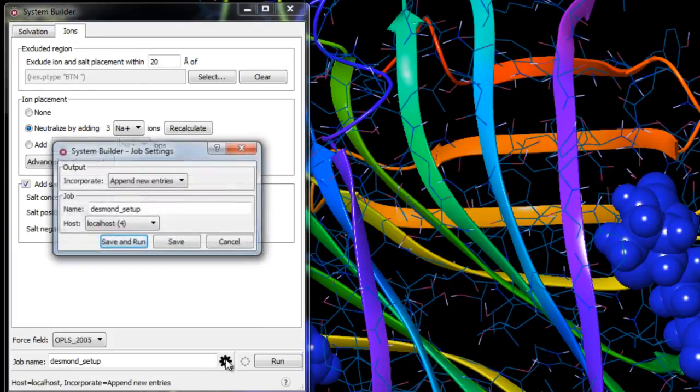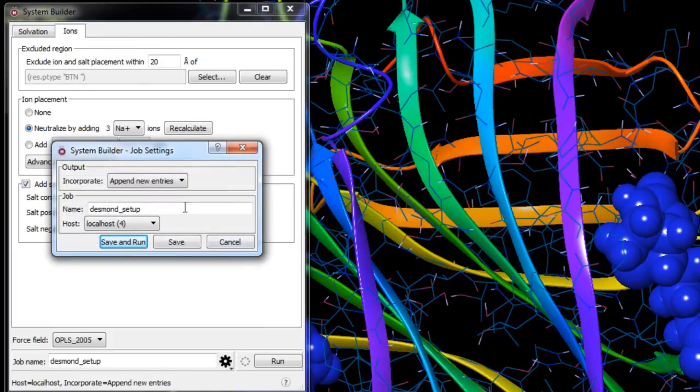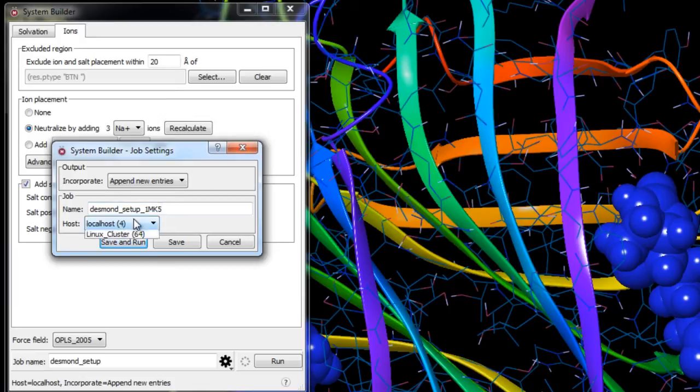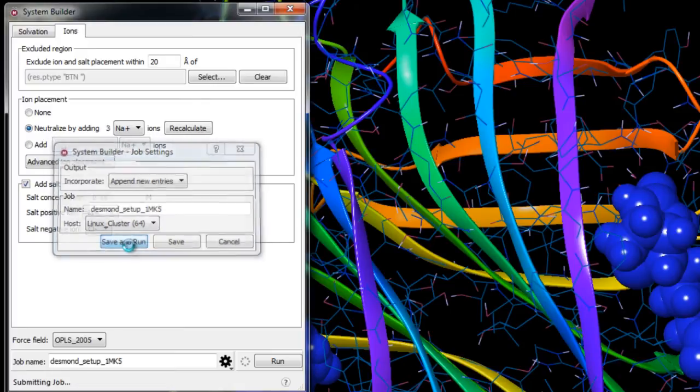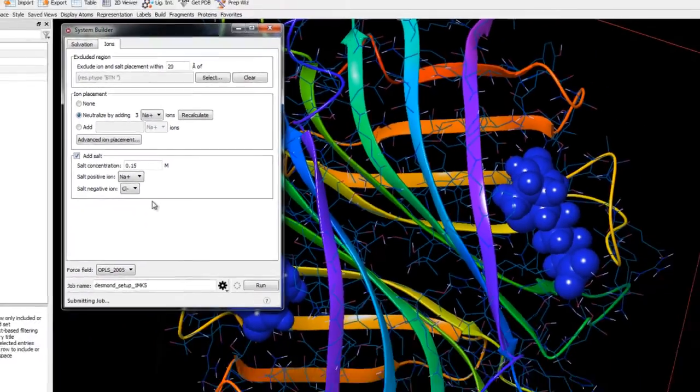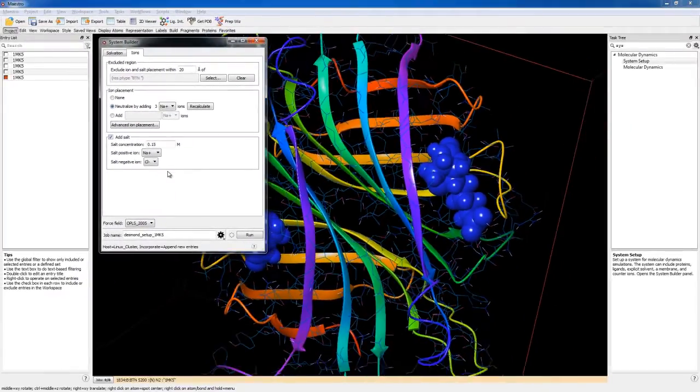I'm in Windows here so I'll submit the job to a remote Linux machine. Now just click Save and Run. System building should just take a few minutes to complete.